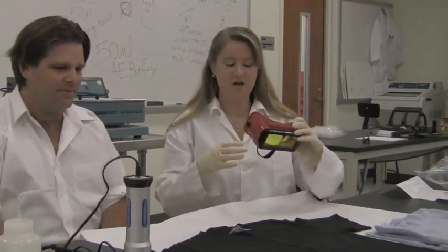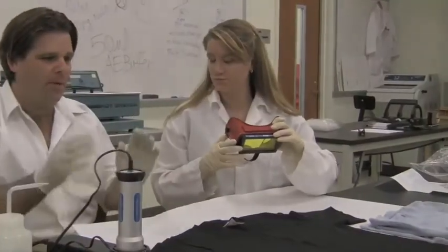We have a special eyewear with a special filter specifically to look through and see the fluorescence of the actual stain. This is a piece of evidence — we could be at the crime scene still.